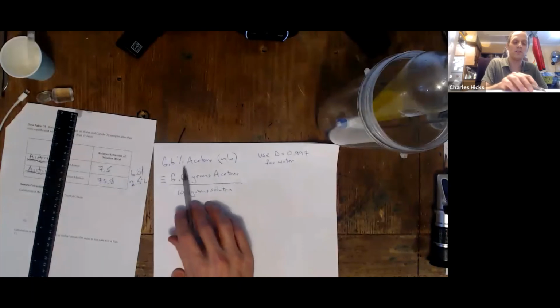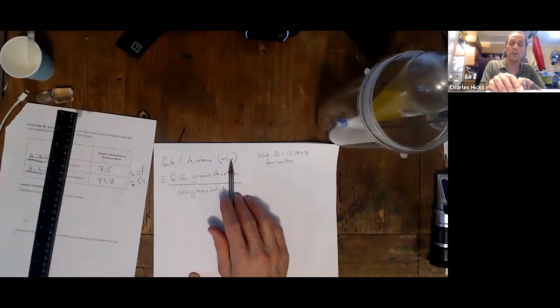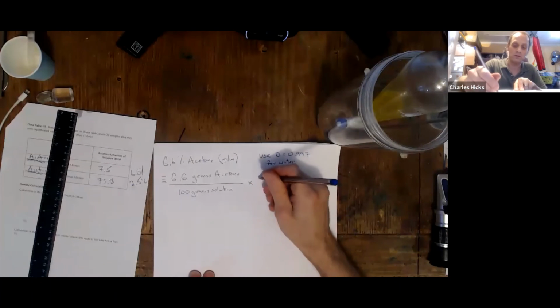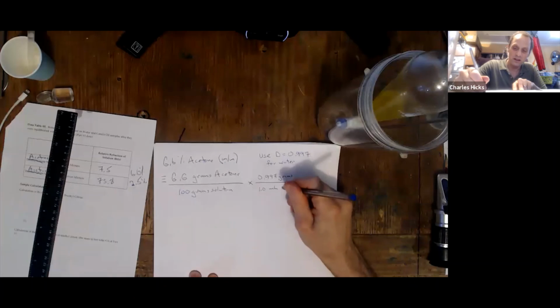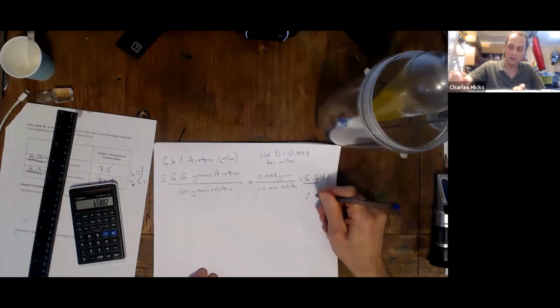So in order to calculate the canola oil water partition coefficient, we need to convert these percentages that were most easily figured out as mass percentages into mass volume percentages. And the way you do that, the way you change the V in the bottom of the percentage, the M into a V, is to use the density of the solution, right? If I write out what 6.6% MM means, it's 6.6 grams of acetone for 100 grams of solution. So here I look up the density of water is 0.997 grams for every 1.0 milliliter of solution. We're going to assume the water-based solutions have a density of water, and the density that we'll use for the canola oil is 0.92. All right, so this is now the percentage MV.